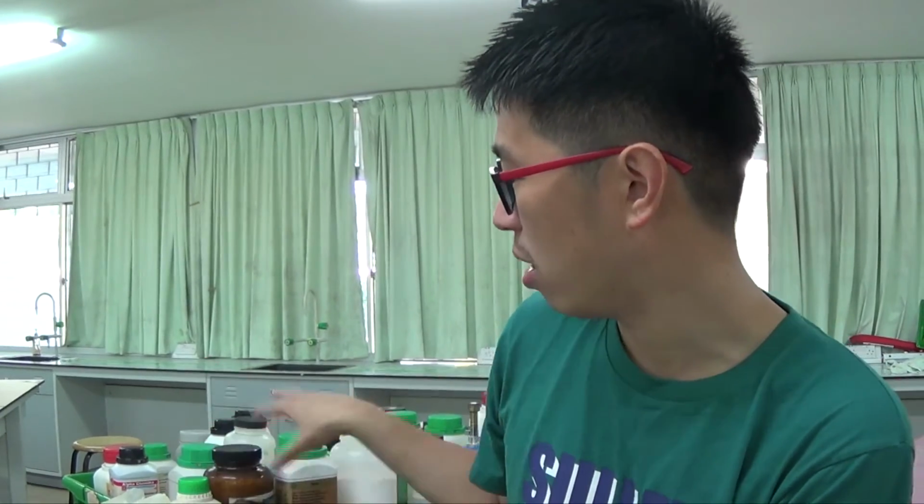That's the whole idea about qualitative analysis, to think about what you see, what you observe, using all your five senses. In today's tutorial video, I will specifically talk on another aspect of qualitative analysis. Behind me, I've got a lot of chemicals that I found in our storage. A lot of these chemicals are no longer commonly tested or assessed in O-level or IGCSE practical, and they have been moved over to the more advanced A-level kind of practical setting.